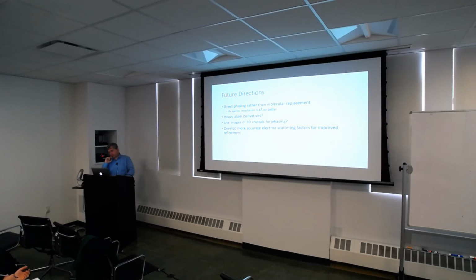Yes, there mathematically is. That's what gives us the anomalous. Yeah, if you can break the Friedel pair, yes, you can. If you break it, you get Ewald sphere curvature and problems like that.